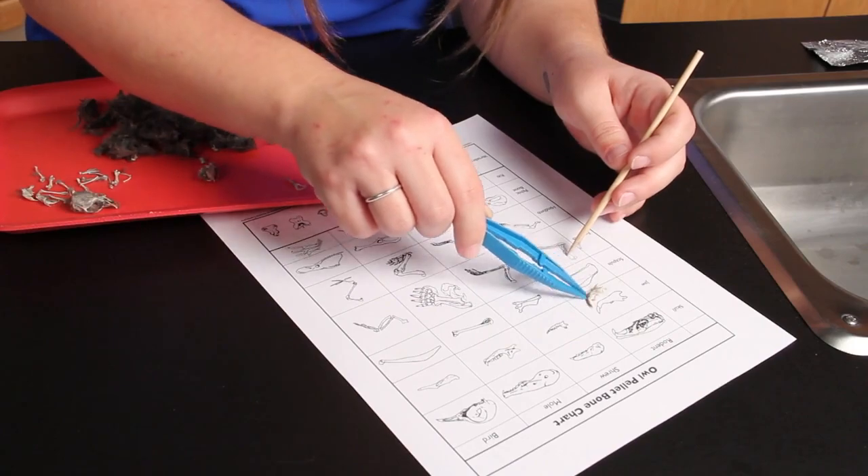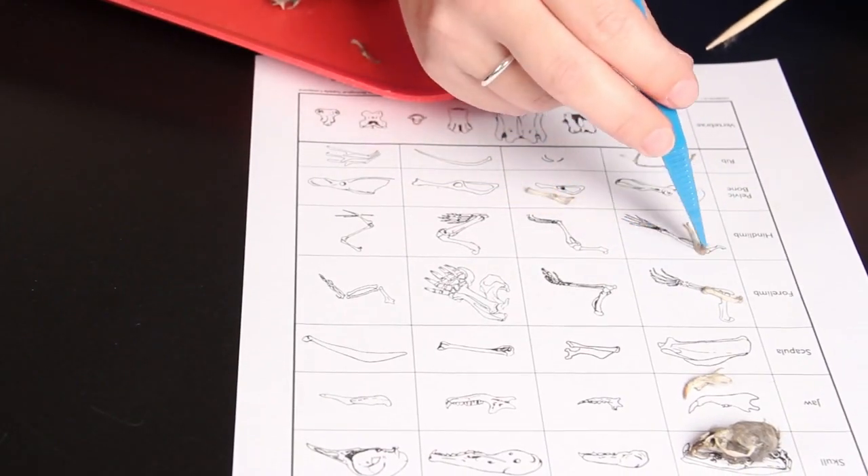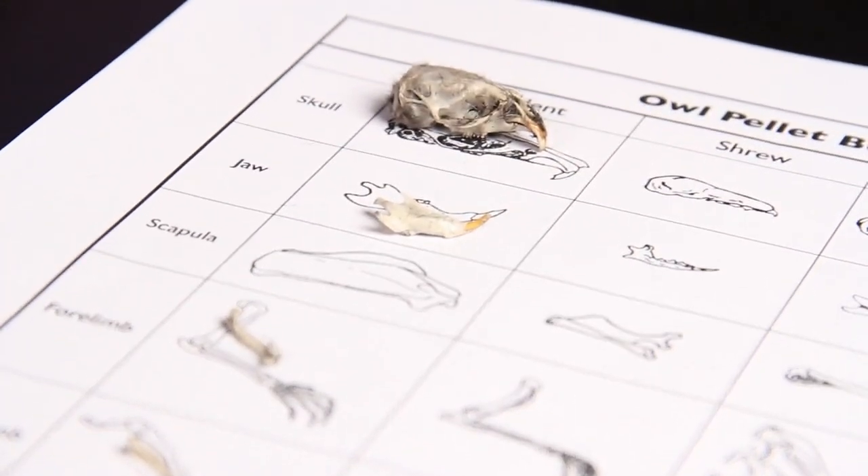Using a sorting chart, categorize and identify the bones. If you can, also try to categorize the animals that the bones come from.